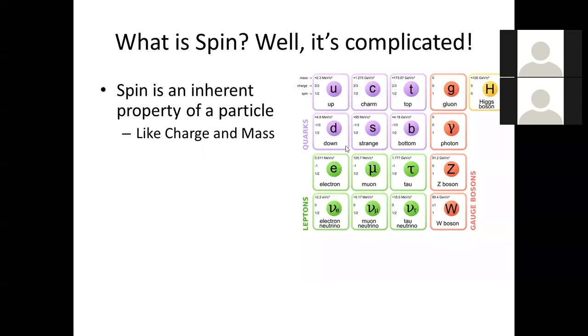Every proton and neutron is made up of several up or down quarks, and they each have half integer spin. However, you can have multiple protons and multiple neutrons in a single nucleus. So what we're really going to be talking about in this presentation are only nuclei that have half integer spins.